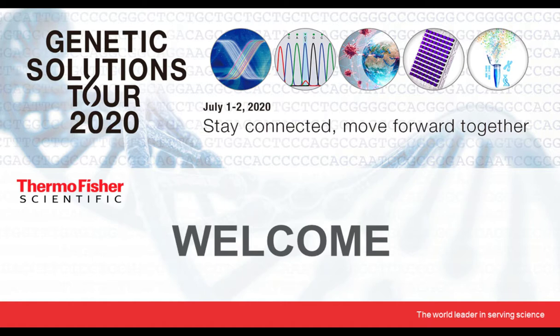First, we will hear from Dr. Steve Jackson, who is a senior member of the R&D team at Thermo Fisher Scientific. He has over 10 years of experience in genetic analysis technology and helped develop solutions for the research and healthcare markets, leveraging varied technologies such as capillary electrophoresis, digital PCR, next-generation sequencing, and microarray analysis at Thermo Fisher Scientific. Today, he will be talking to us about the complete workflow for cell line authentication, CAR-T, and iPSC sample matching through analysis of highly variable short tandem repeats, STR.